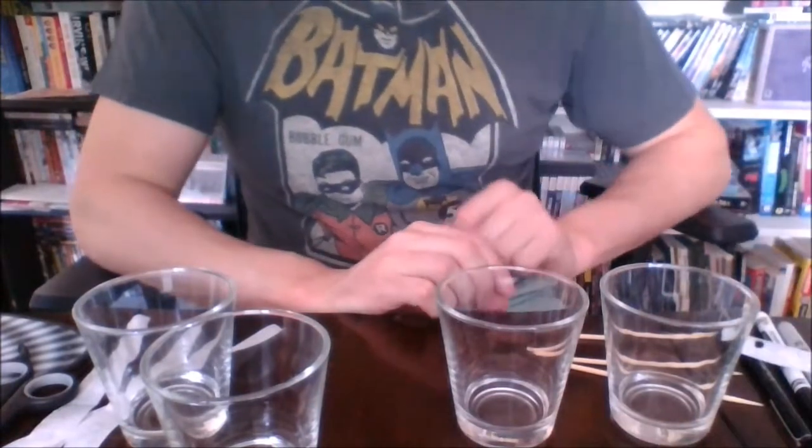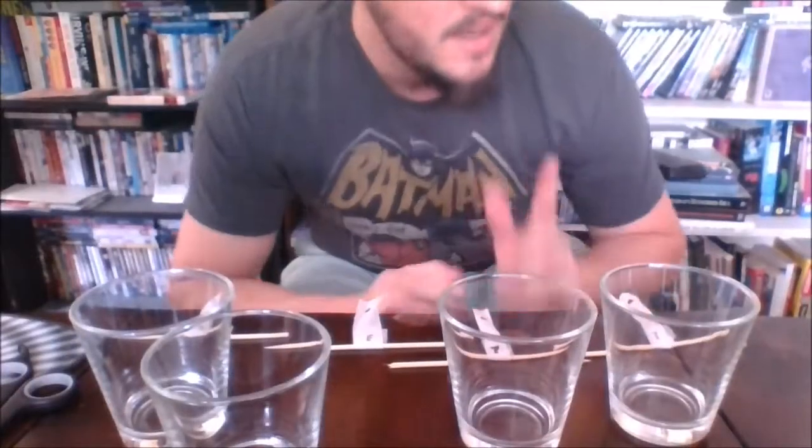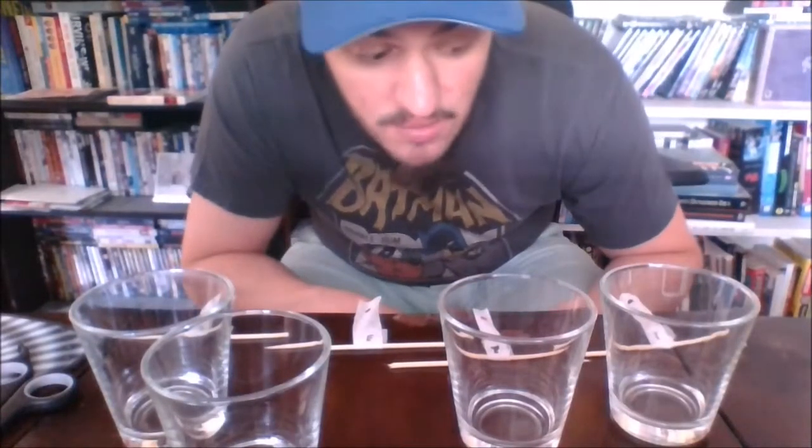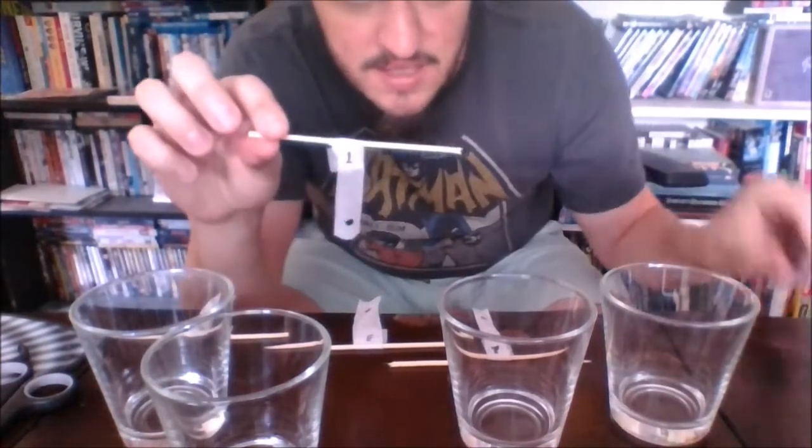And after those samples are prepared, we'll dip them in this acetone and see how that looks. Okay, we're ready to go now. I have my 4 samples set out and ready. Sample 1 is this gel pen.